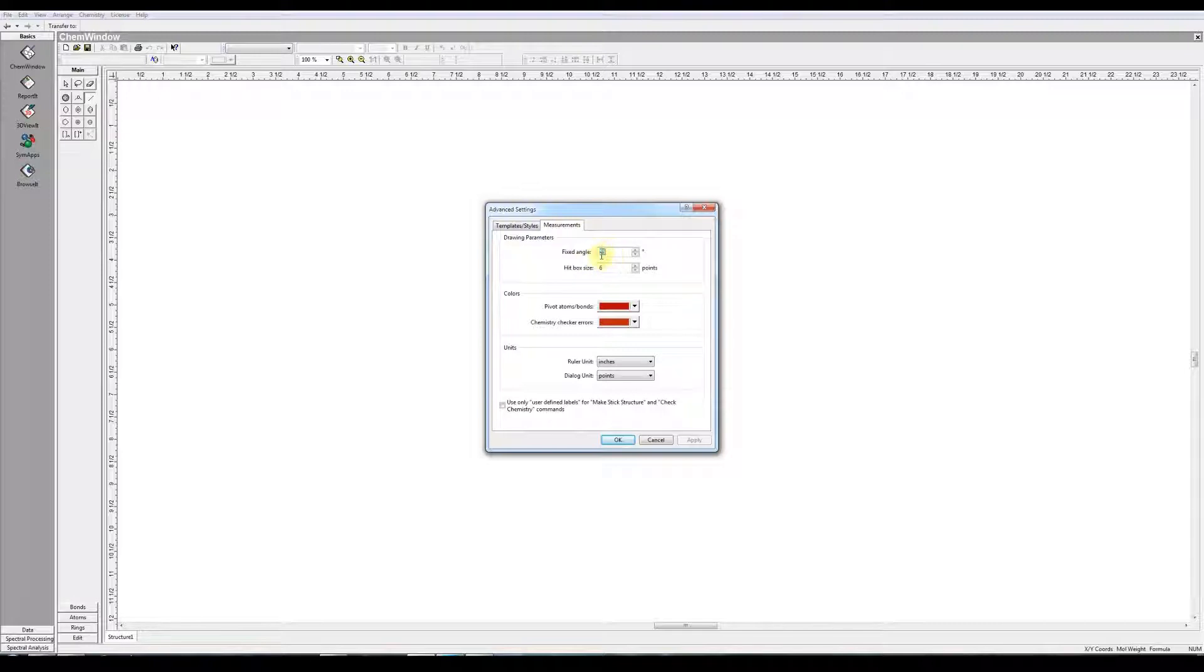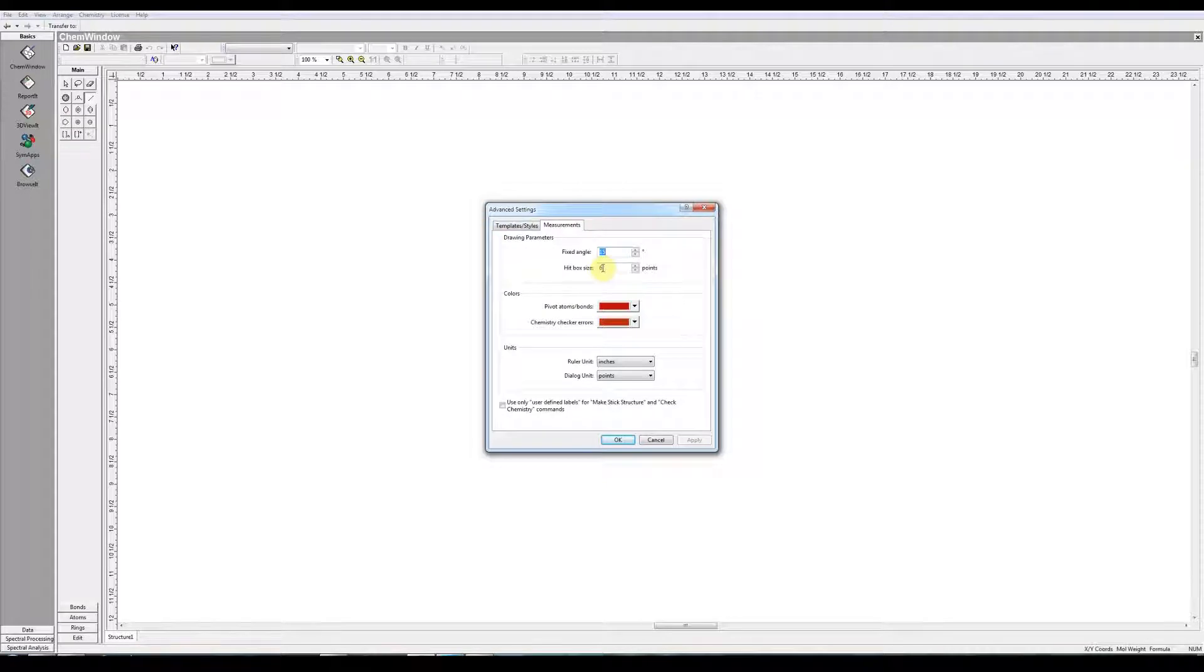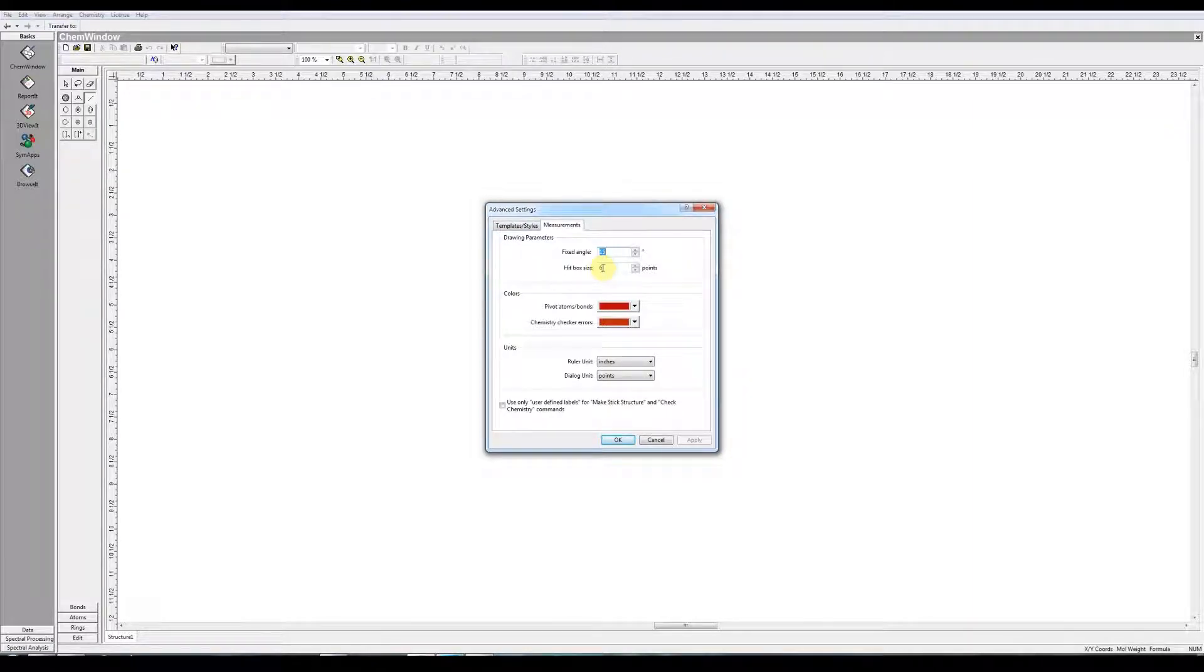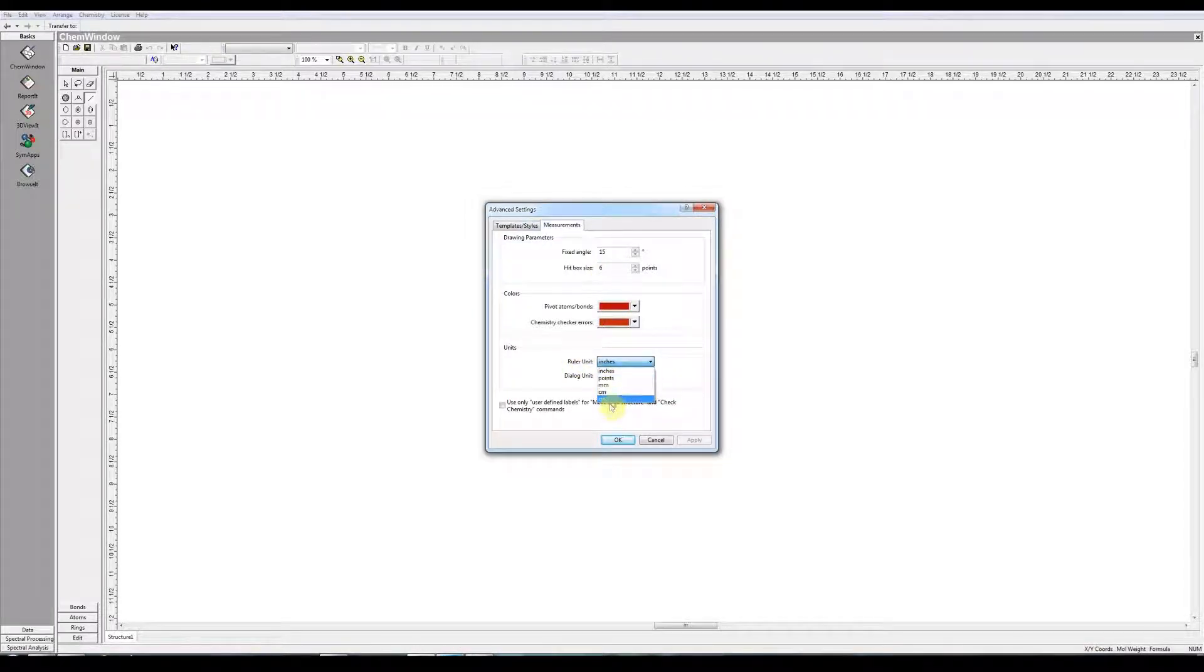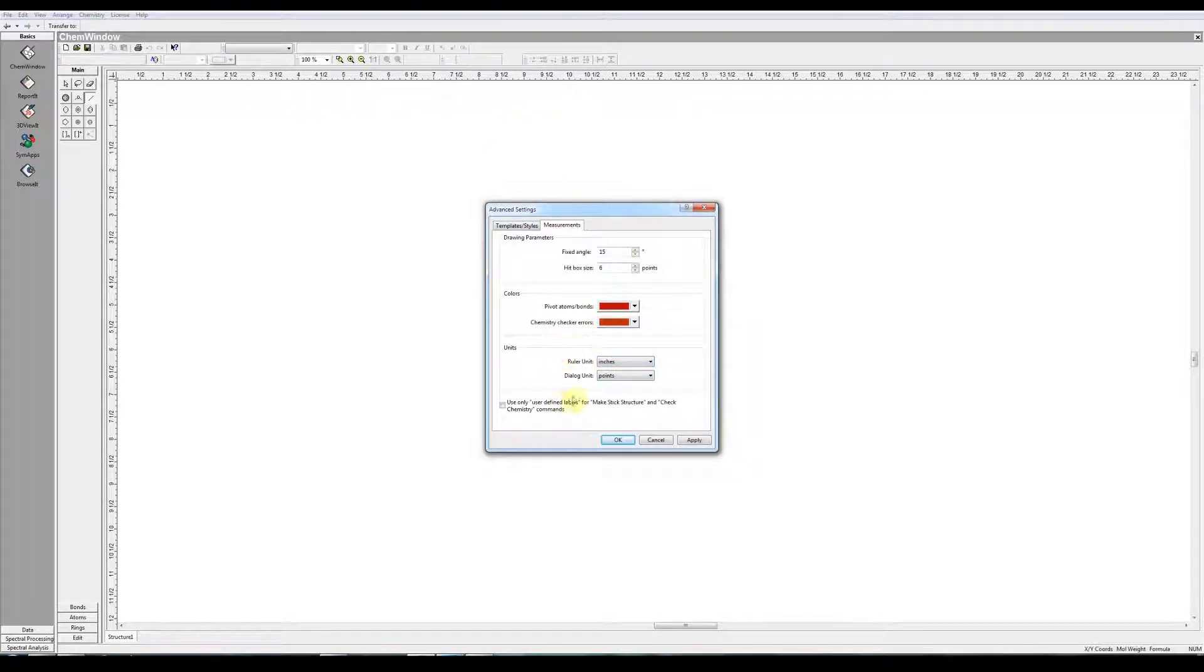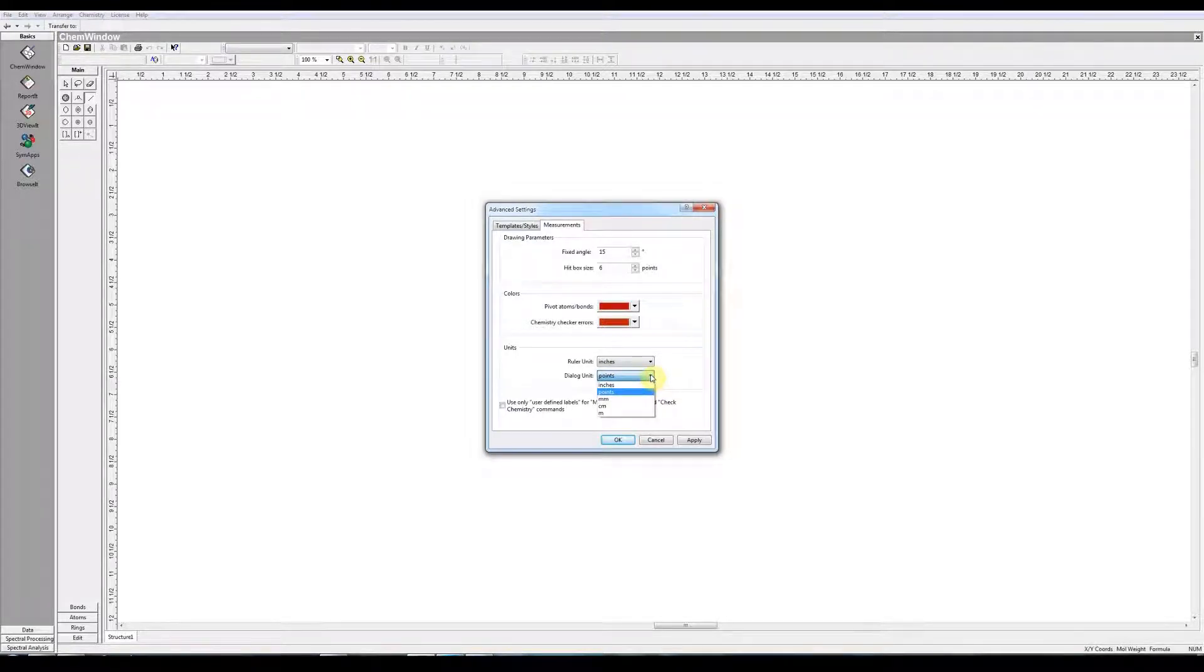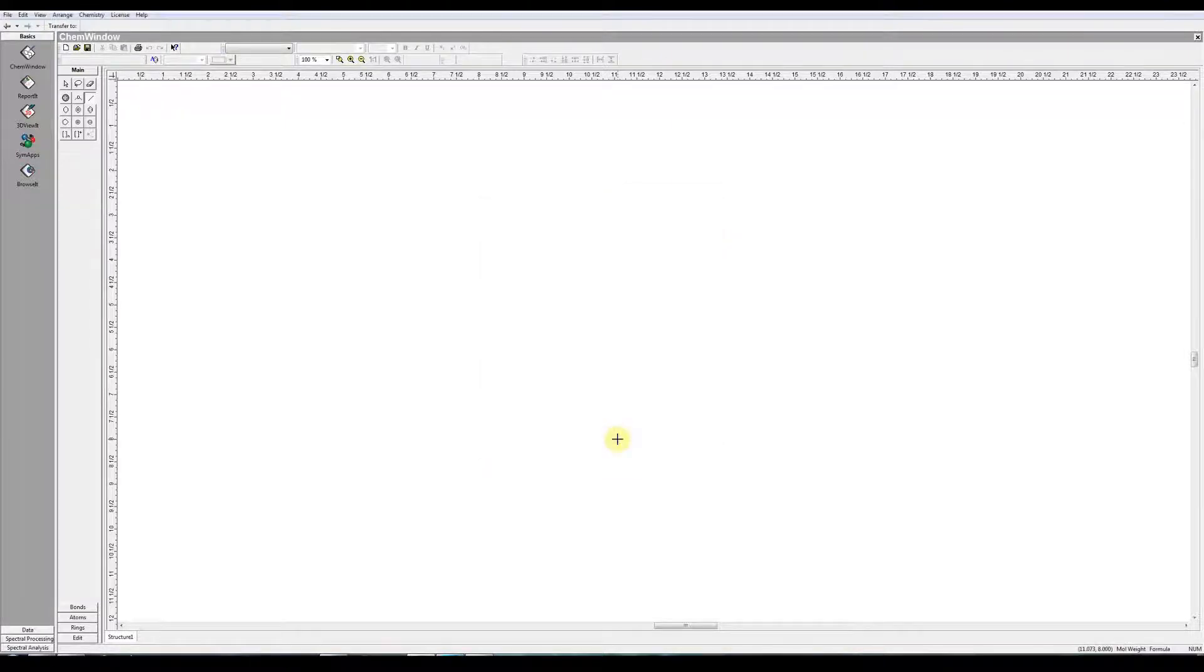Under the Measurements tab, here we have the fixed angle. So when you draw a bond and want to rotate it, it'll rotate in increments of whatever you've set here. 15 degrees is default. A hitbox is a region around an atom, which if you click on or drag from, it makes sure that whatever you are attaching is actually attached. If you're outside the hitbox, it won't physically connect it. So you can set the size of the hitbox here. We have the units for the ruler. You can choose from a variety of units. Inches is the default, and I'll leave it at that. And then we have the dialog units. The dialog units are, for example, the bond lengths. And that's often selected in points, but you can choose it as you wish.